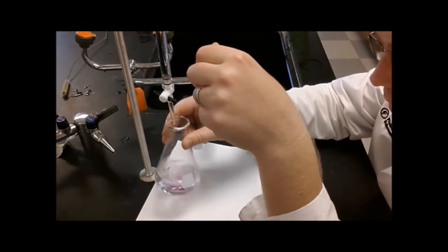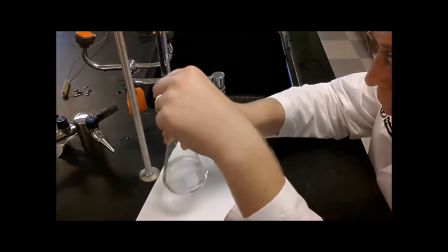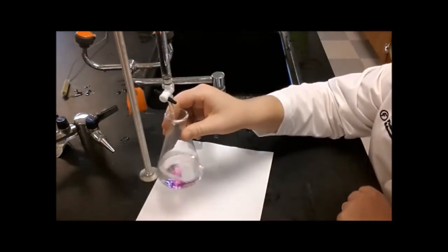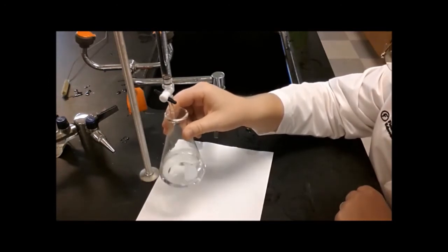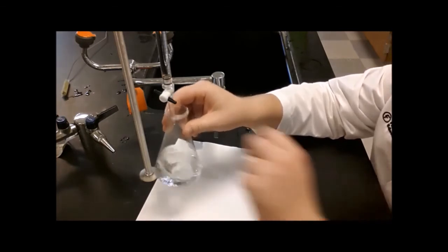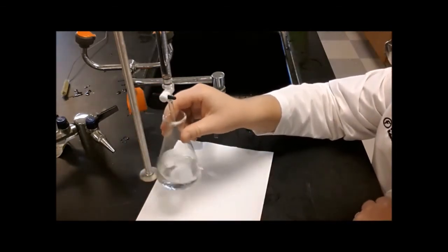And now see, I'm swirling it. The color's going away as I swirl it. What happens is when you add the base to the flask, where that base has been added, there's no moles of acid around it to neutralize it. So by swirling it, I put the moles of acid in contact with the base and it neutralizes the base.